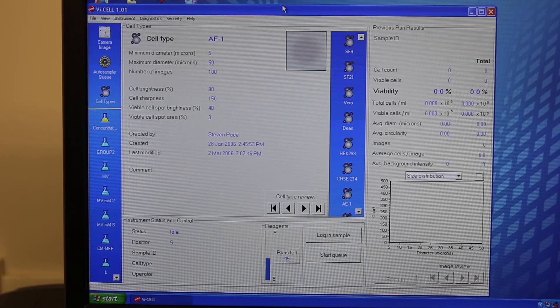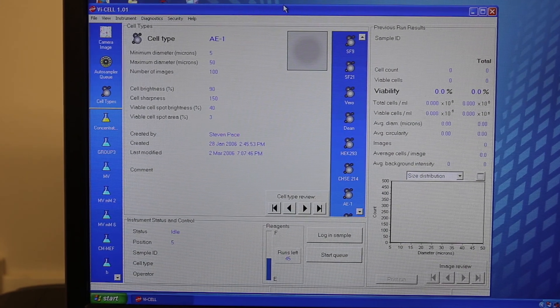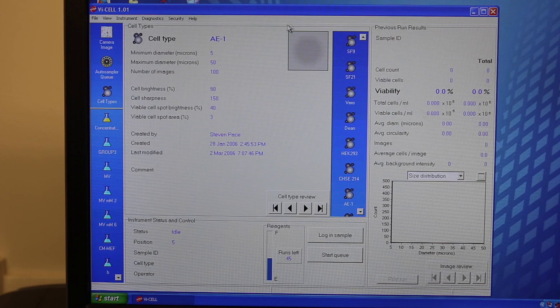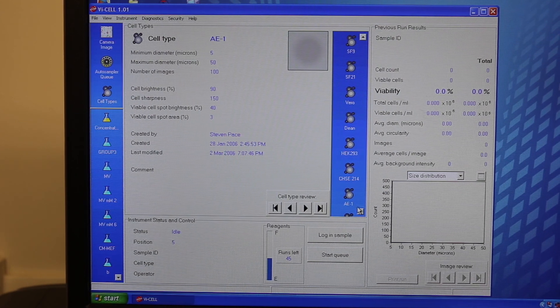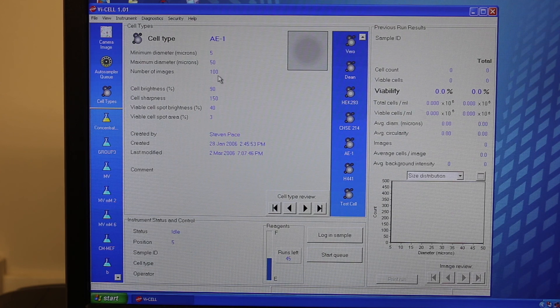When you begin to use a new cell type that is not pre-programmed into the computer, you are able to pre-program some of the aspects of it. Each cell will vary in the degree to which you measure the brightness, sharpness, spotness, and spot area of the cell. To add a new cell, go to File > Cell Types > New.